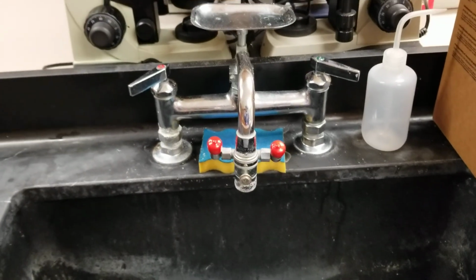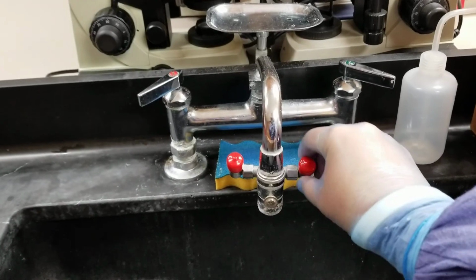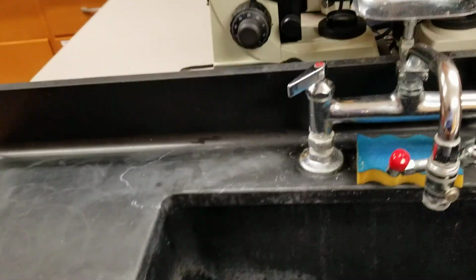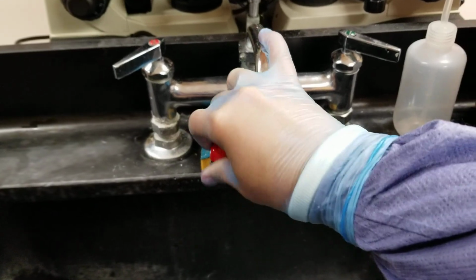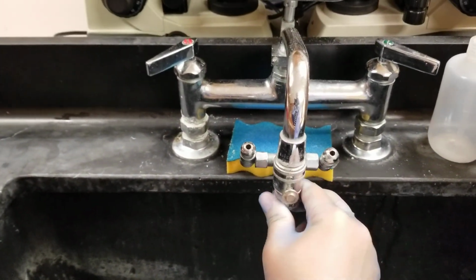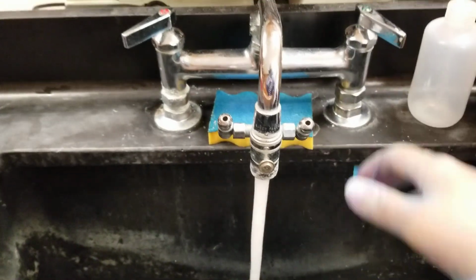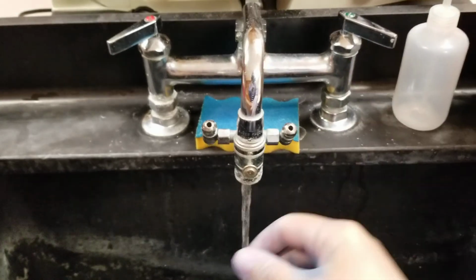In our simulation of a chemical spill, someone leads the victim to the eye wash station back here, because this one we can actually use and test without getting the entire classroom messy. So in order for this to work, you always turn on cold. Do not ever use hot water, okay? And I'm going to do it at a low flow so that we don't get really submerged here.